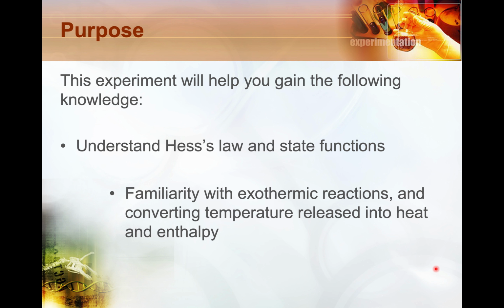And then finally, we'll be doing a lot of exothermic reactions today, and you'll have confidence in understanding the idea that the heat released from a reaction that's then transferred to a solution causes that solution temperature to change, and you can then relate the temperature change of a solution to the enthalpy of a reaction.